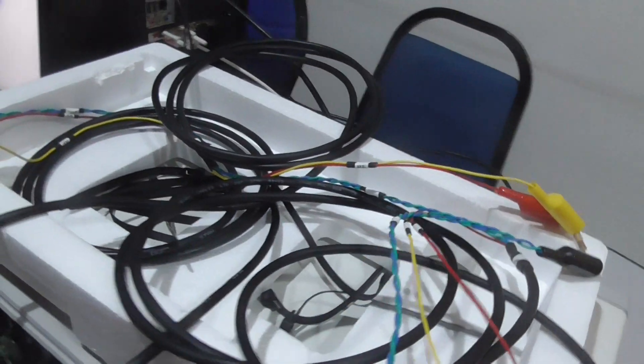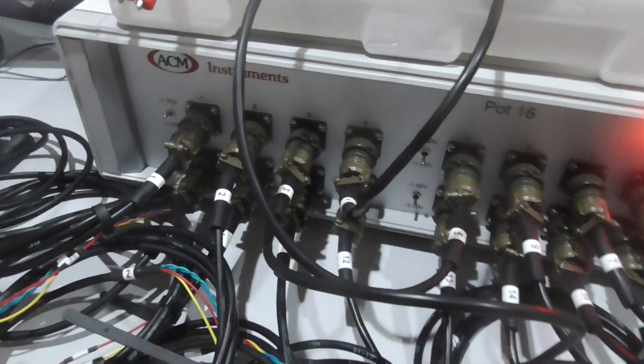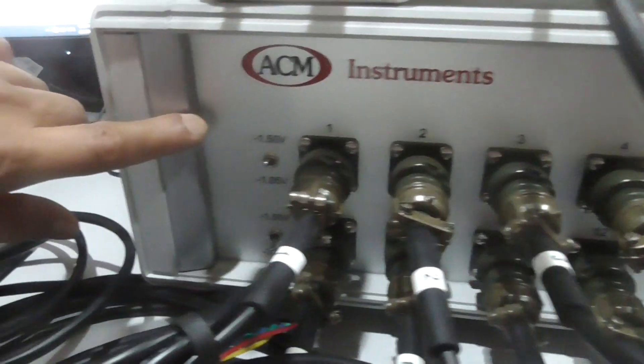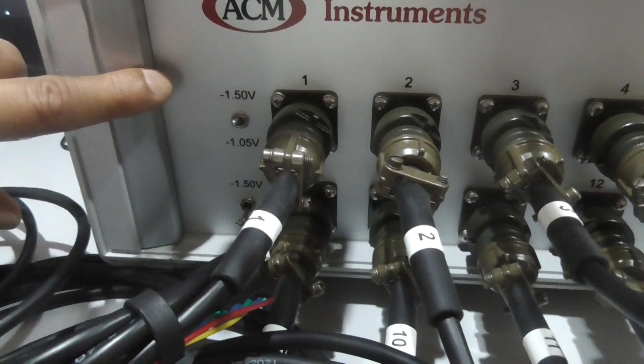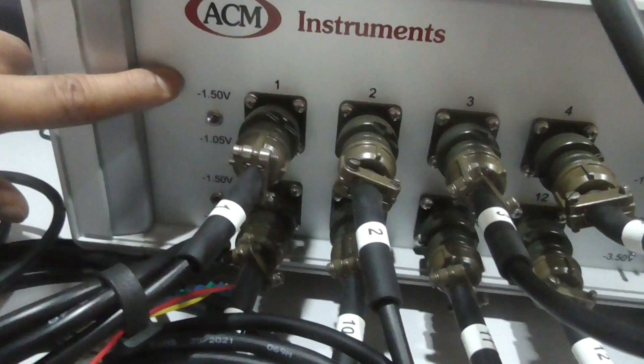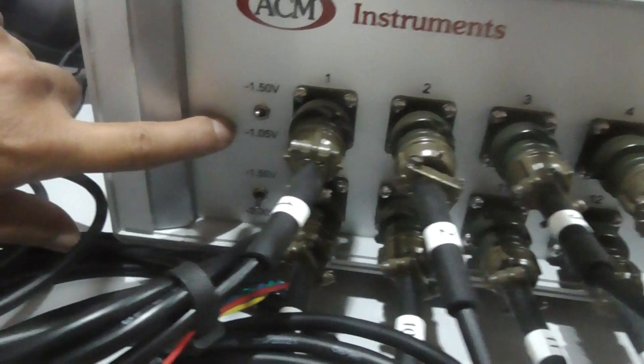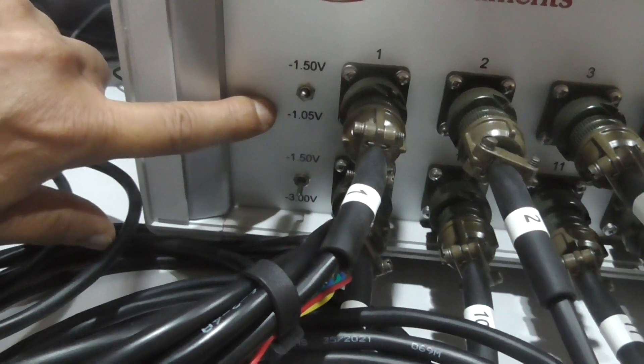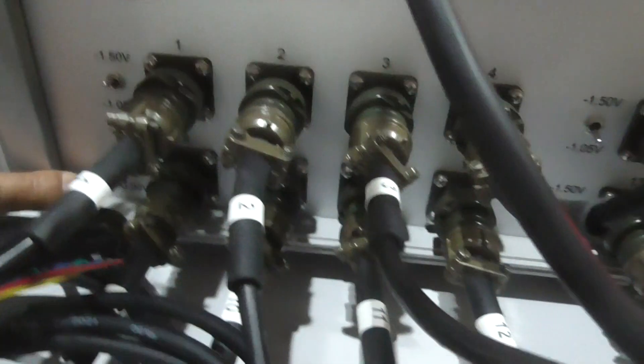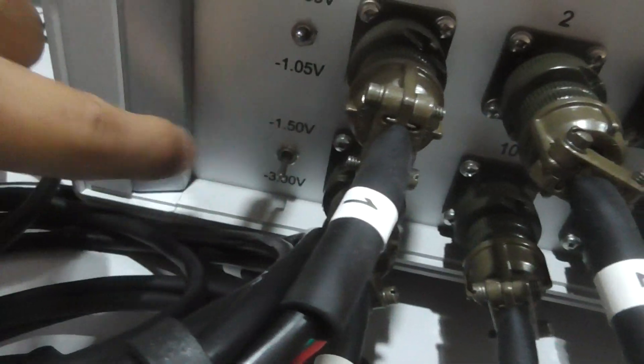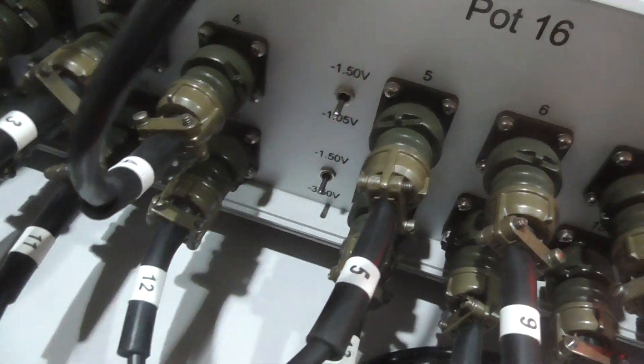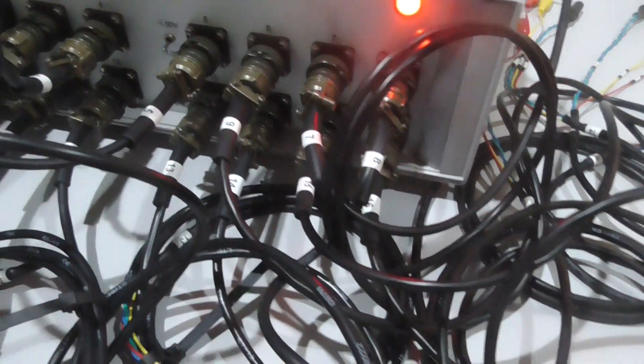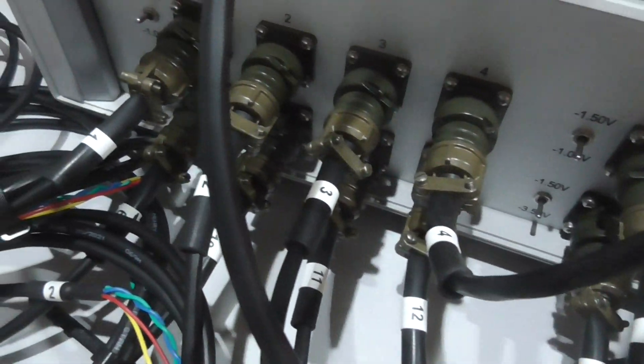The output, you can see here they have an output potential which has 4 separate values. This is minus 1.5 volt, you also have minus 1.05 volt, you have minus 3.0 volt, and also minus 3.5 volt. Those are the channels that you fix and it will automatically measure by POT16.